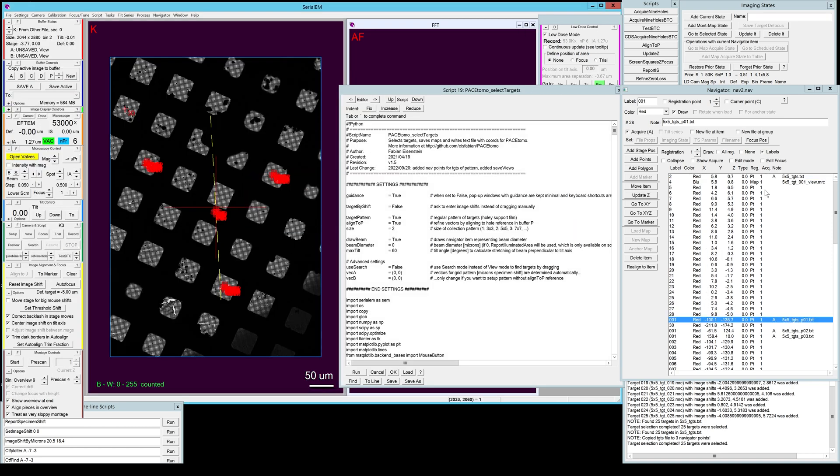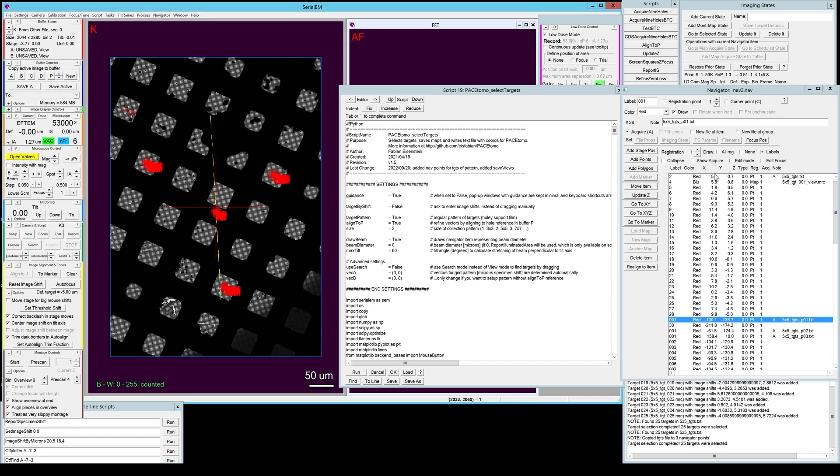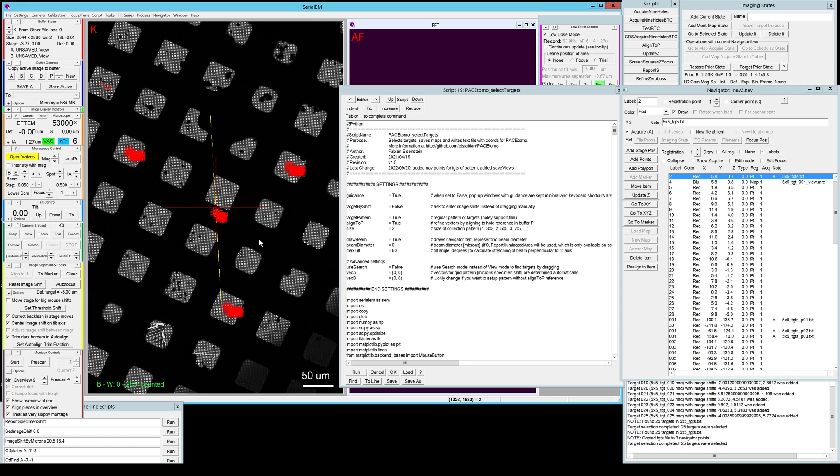As I said we can select which ones we want to acquire and which ones we don't want to acquire.